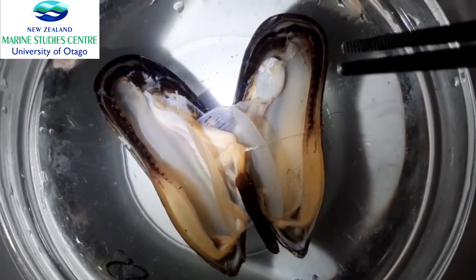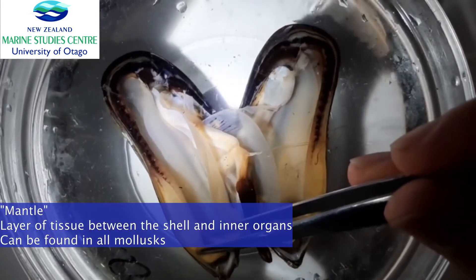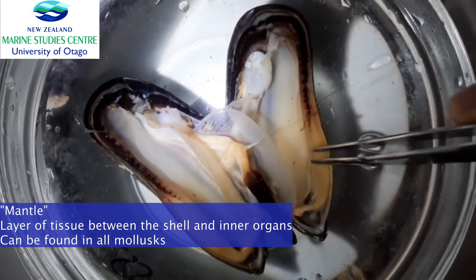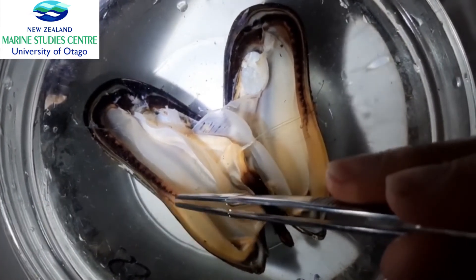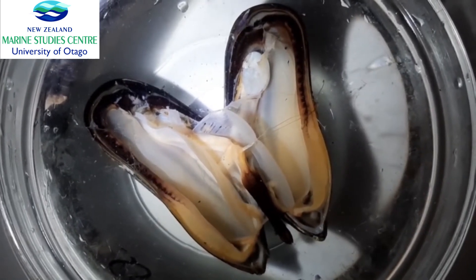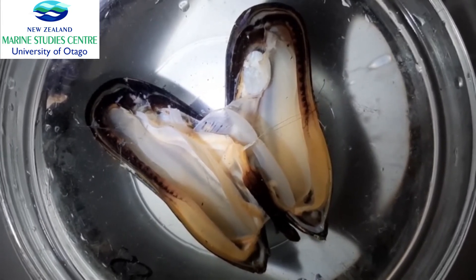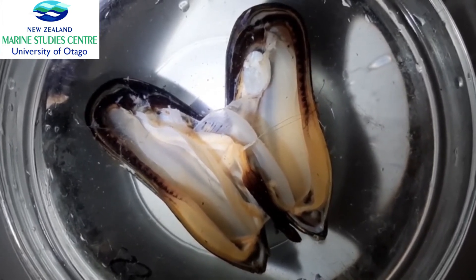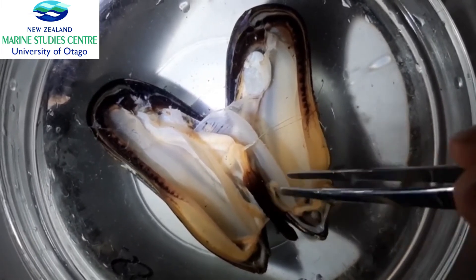Now we'll look at the mantle. This soft body tissue that you can see around the inner organs — all of that is the mantle. If you've ever eaten green lip mussels at a restaurant, you know that as soon as you open the shell you see this kind of orange, thick, fleshy part that surrounds the inner body. That is the mantle.